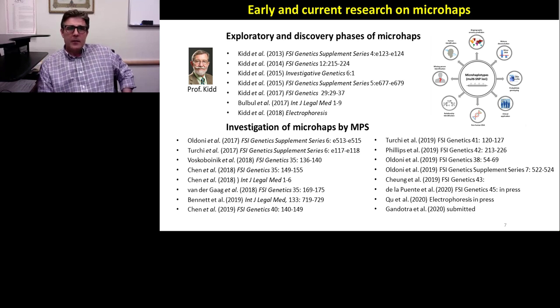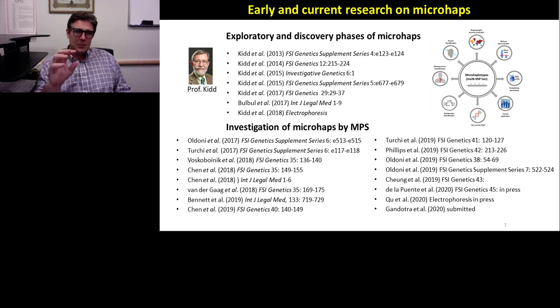So as I said earlier, Professor Kidd is the one that thought of this, and he started publishing papers. The first paper was, as I show here, in 2013, and he was the one that mostly published on this for the first 5 years. But then there was an explosion of papers, and there's actually more that have come out and are coming out, including a couple that we submitted, and we're waiting for the reviewers to get back to us. So there's consensus in the community that this is actually a good forensic DNA marker.